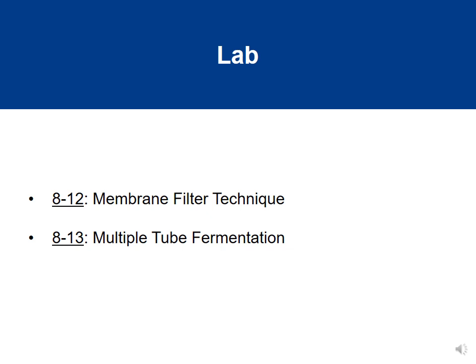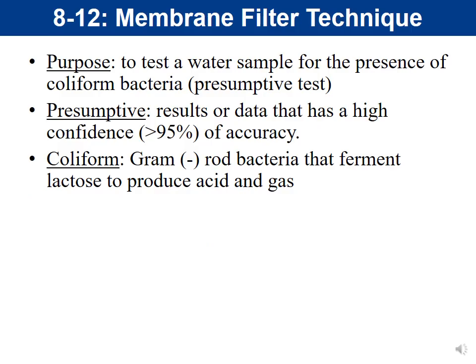So in this video, we are going to talk about two techniques, a membrane filter technique and a multiple tube fermentation. And both of these techniques are basically to do water sample testing. And so let's talk about what we're doing. So we'll start with our membrane filter technique.